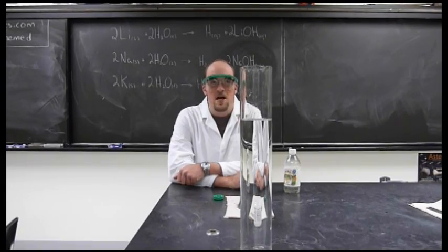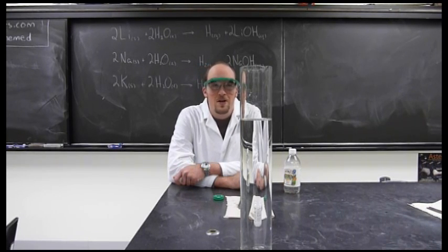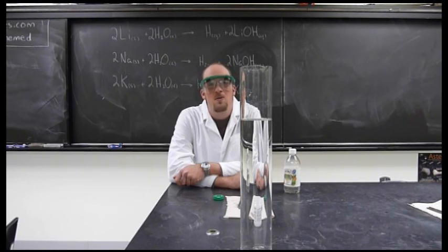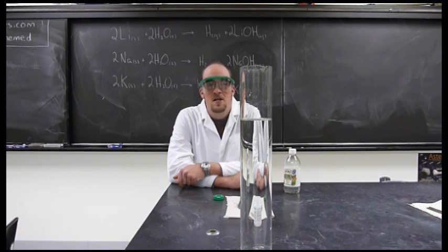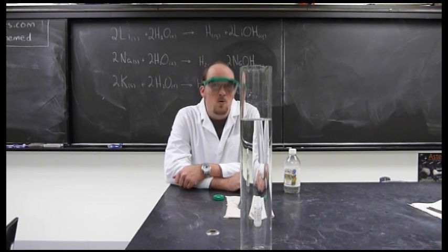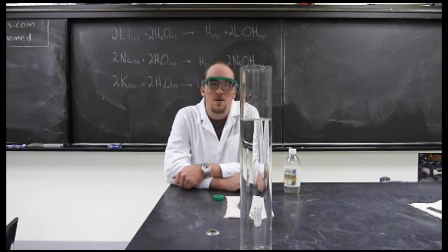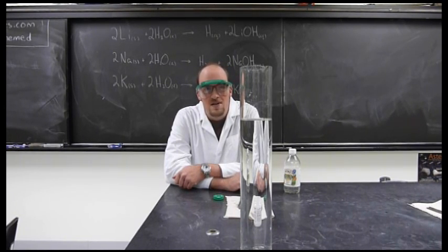I wanted to show you the reaction with potassium again because it's pretty cool. But also, I wanted to show you evidence of the chemical changes that I'm going to describe with each of these reactions. So what you see here in front of you is a cylinder full of water. What you can't see is that I've added a little bit of phenolphthalein, which is an indicator that turns a really kind of bright pinkish purple color in the presence of a base. Basically, it changes color whenever the pH goes above about 7.5.